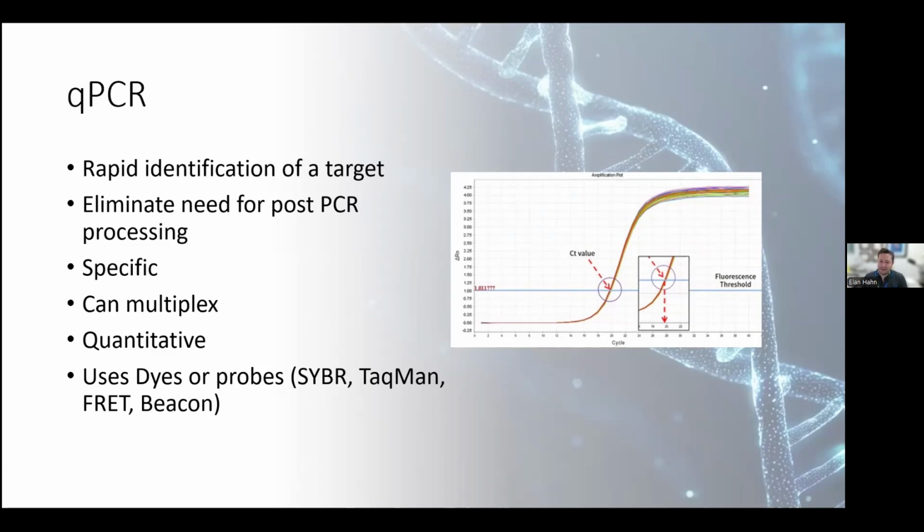And using the standard curve when the amplification efficiency is 100%, the CT value for quantifying a single copy of the gene is usually around 35. So anything above 35 for a CT value, theoretically, the initial copy of the template is less than 1, and it's not really considered statistically significant. So when we look at a qPCR plot, we're seeing at what cycle did we get detectable amplified product. The earlier we get it, the more of our target there is. The later we get it, the less of our target there is.